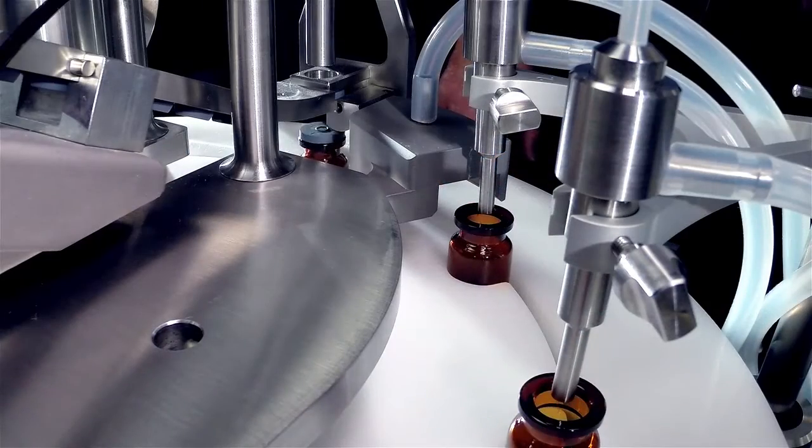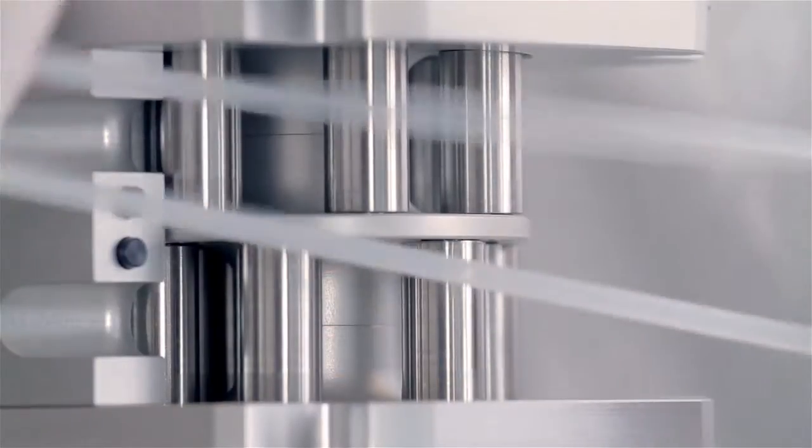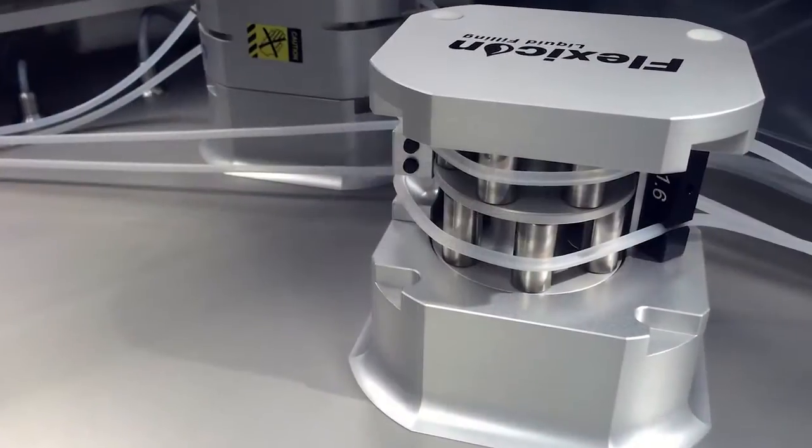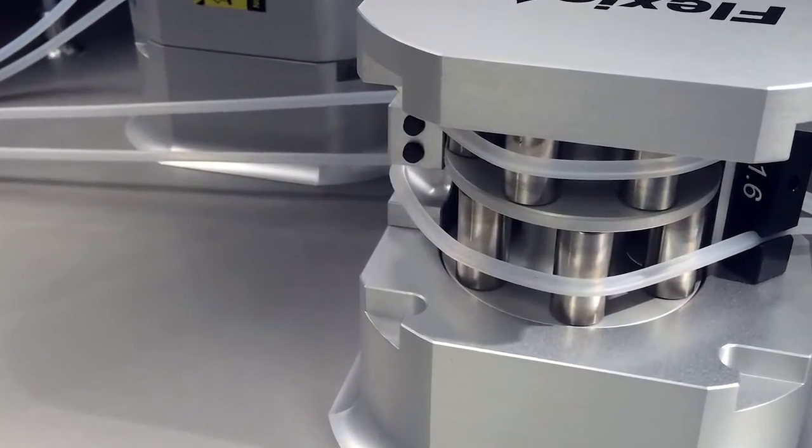Peristaltic fillers prevent costly overfilling on volumes from less than 0.2mL to 100mL. Liquid only contacts a single use fluid part, so a changeover from one liquid to another can be done quickly without the risk of cross contamination.